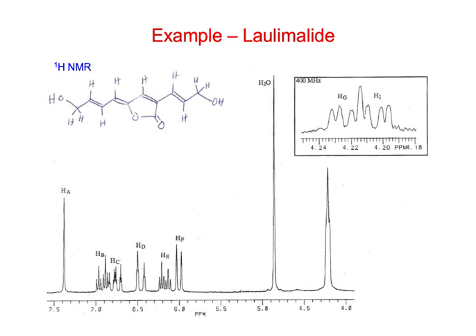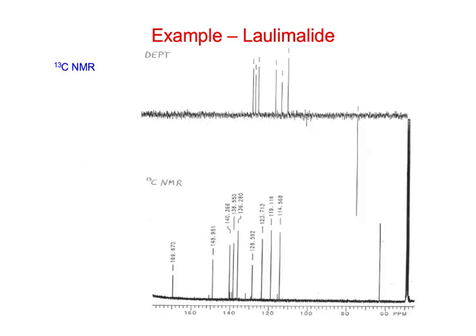All right, so here's back. We've seen this compound a few times. And so this is just some examples. We went through and drew all of the peaks and all that kind of stuff. So this is actually data from way back in, when did I go there? Like 1988 or something like that. And so some of this was kind of pretty new. So here is the C13 and the DEPT. The scales aren't the same.